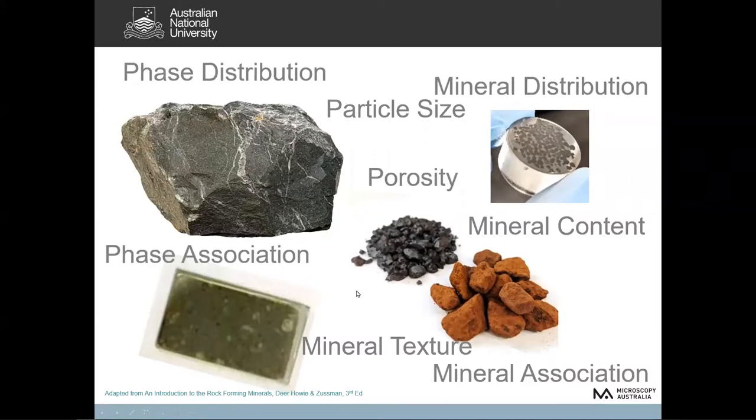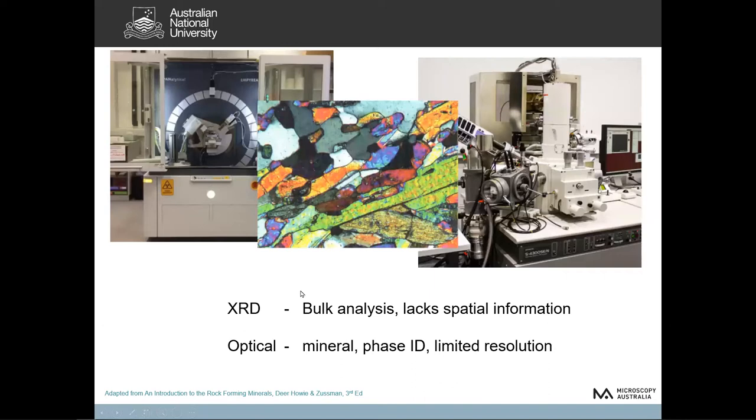So some of the techniques you have available to you would be XRD. Generally, that is more of a bulk analysis technique. You don't really have the spatial information, how the minerals are associated with each other, for instance. Also, you don't get any chemistry. Optical approaches can give you the mineral phase ID. It has limited resolution, though, so you tend to have problems when you get to the smaller particulates in the micron size range.